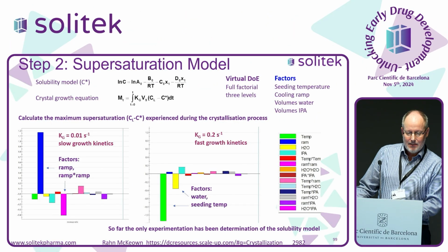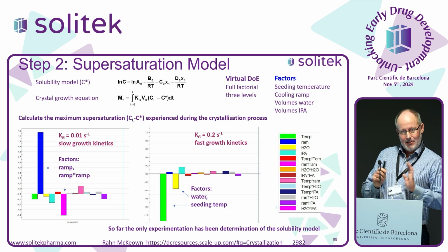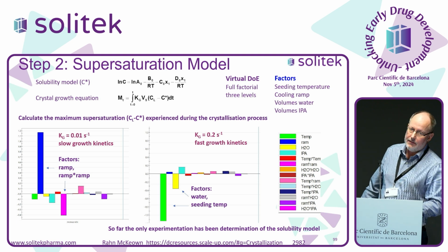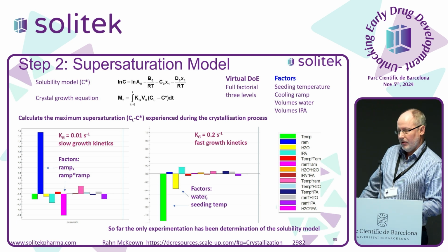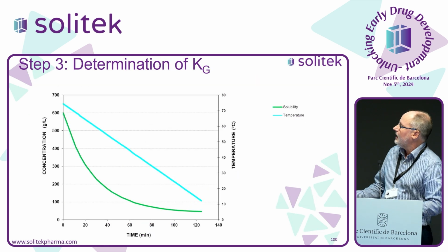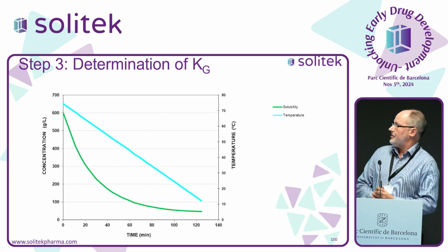On the other hand, you might want to take it to the next level. I'm sorry I don't have time today to go into extreme detail about this, but if anyone's interested, I highly recommend looking at this webinar from Ran McEwen, who explains in detail this kind of approach. So going to the next level, we need to determine our crystal growth constant, which is Kg.